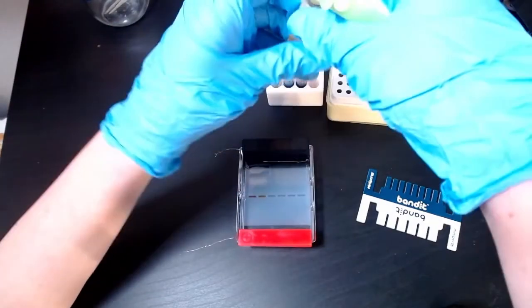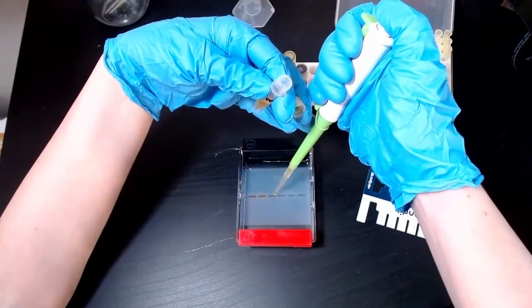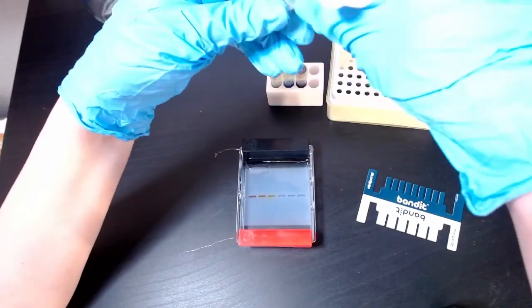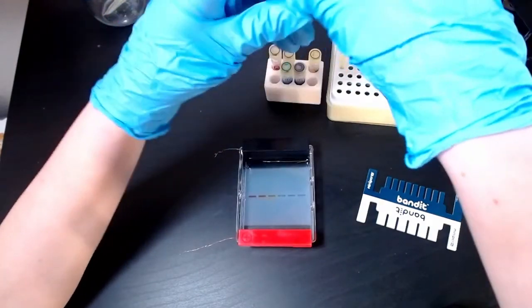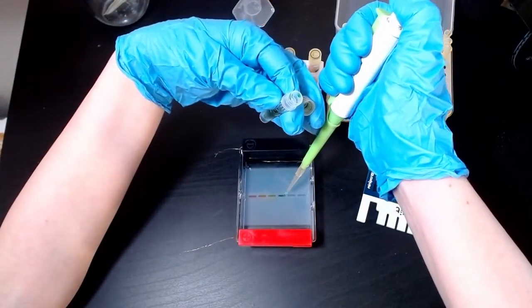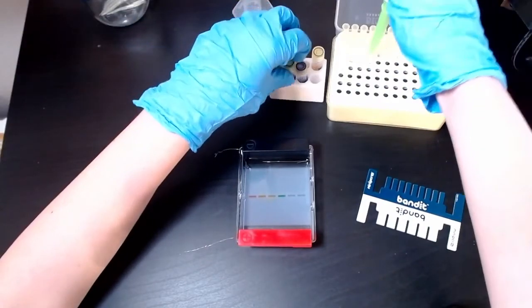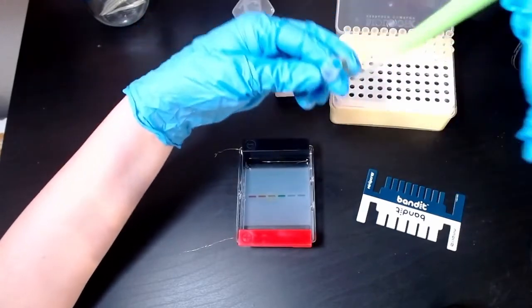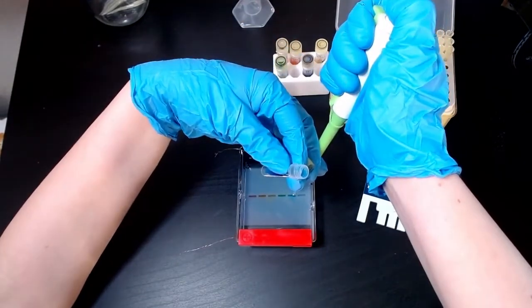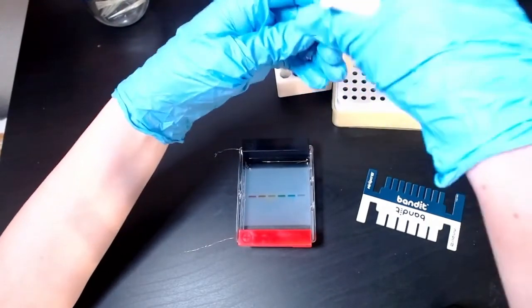Next, of course, we're going to go from red to orange to yellow. So we're going to add 10 microliters of our yellow dye. Oops. Right into our gel. After yellow is going to come our green dye. After green is going to be blue. And finally, in our last well, is going to be our purple dye.